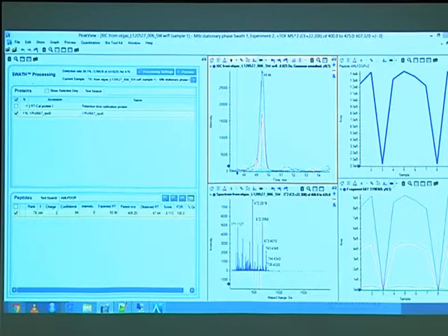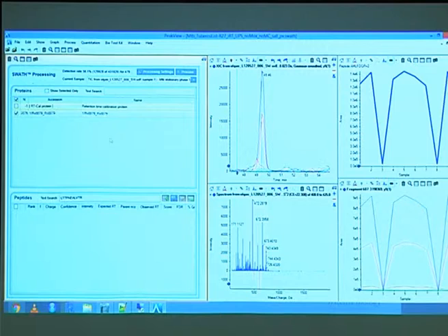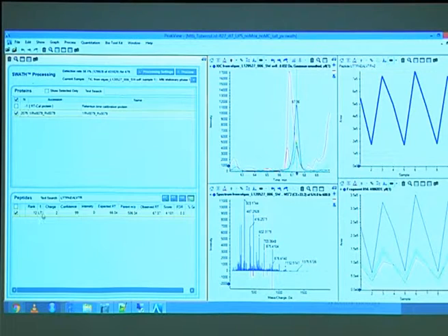We've already seen an example for an interference. Let's have another one. We get to learn a new protein, RV0079. I have no idea what that is. So in this case, you see, because I analyzed it in triplicates, that the samples here, number 1, 4, and 7, are the same. These are technical replicates, so they should show the same.